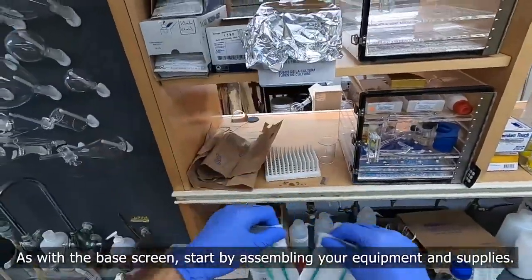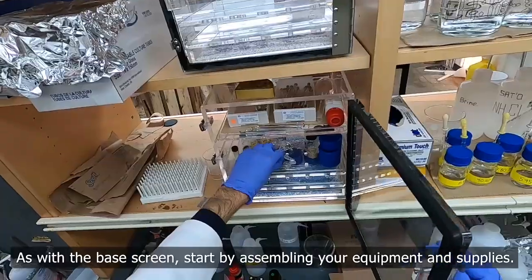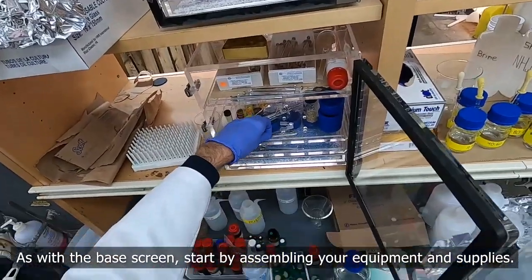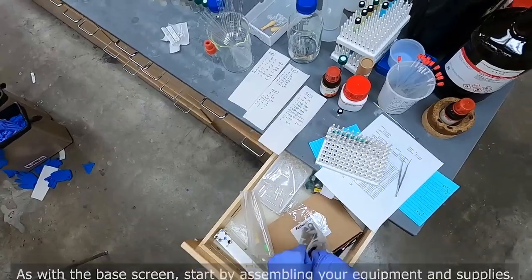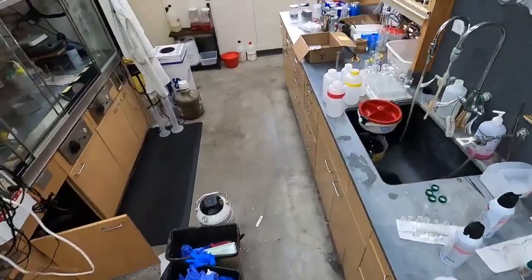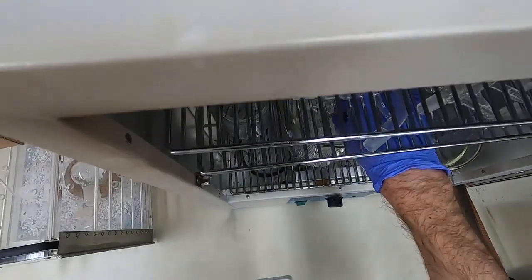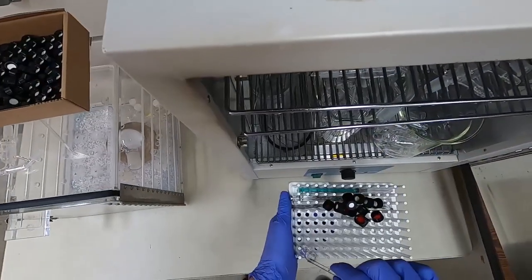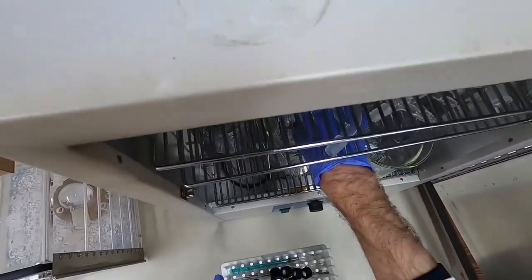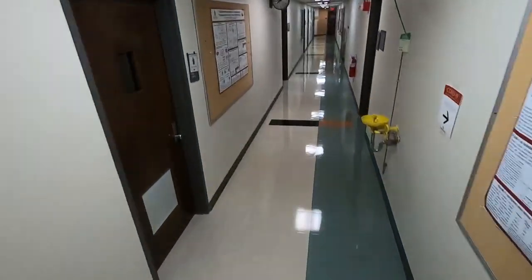Syringes. Tweezers, spatula, grab a couple of extra caps, and the last thing we need is vials. I keep those in the oven so that they stay dry. As soon as I take them out of here, they're going to be exposed to the humidity. I always do this as my last step. And so yeah, once I get these vials out and I get them on the tray, I go right to the glove box. I just go immediately there.